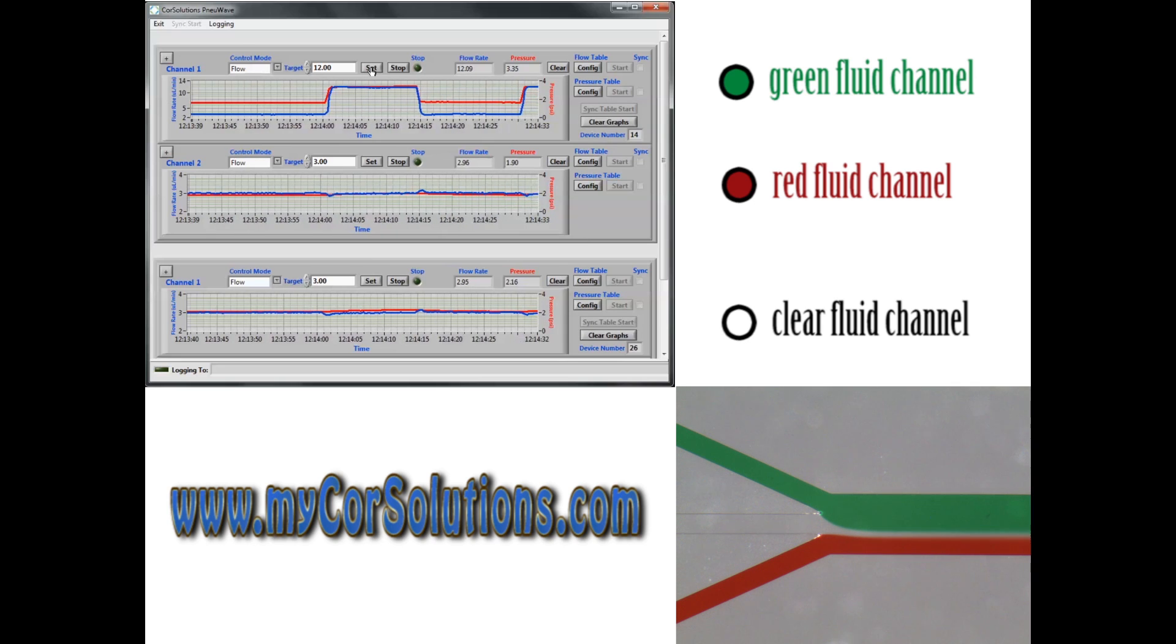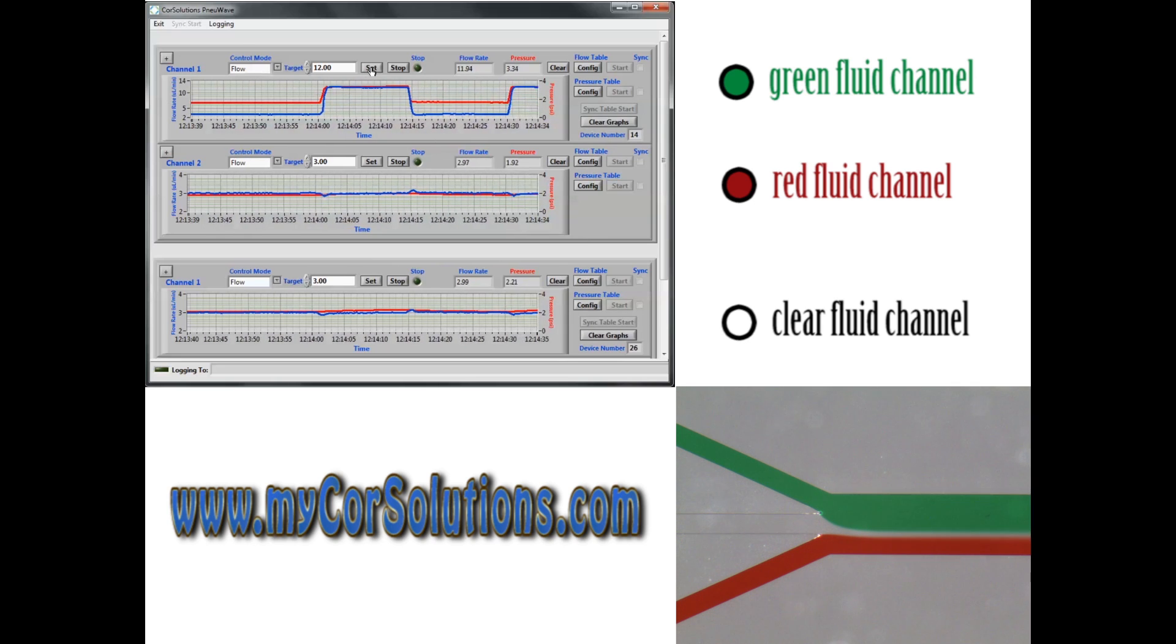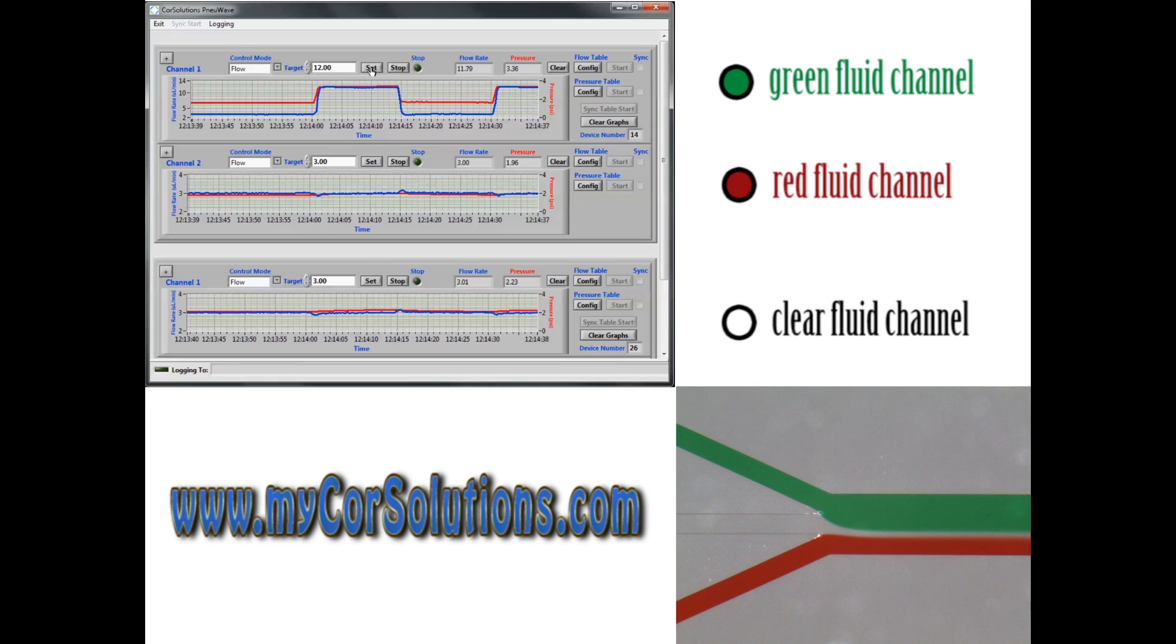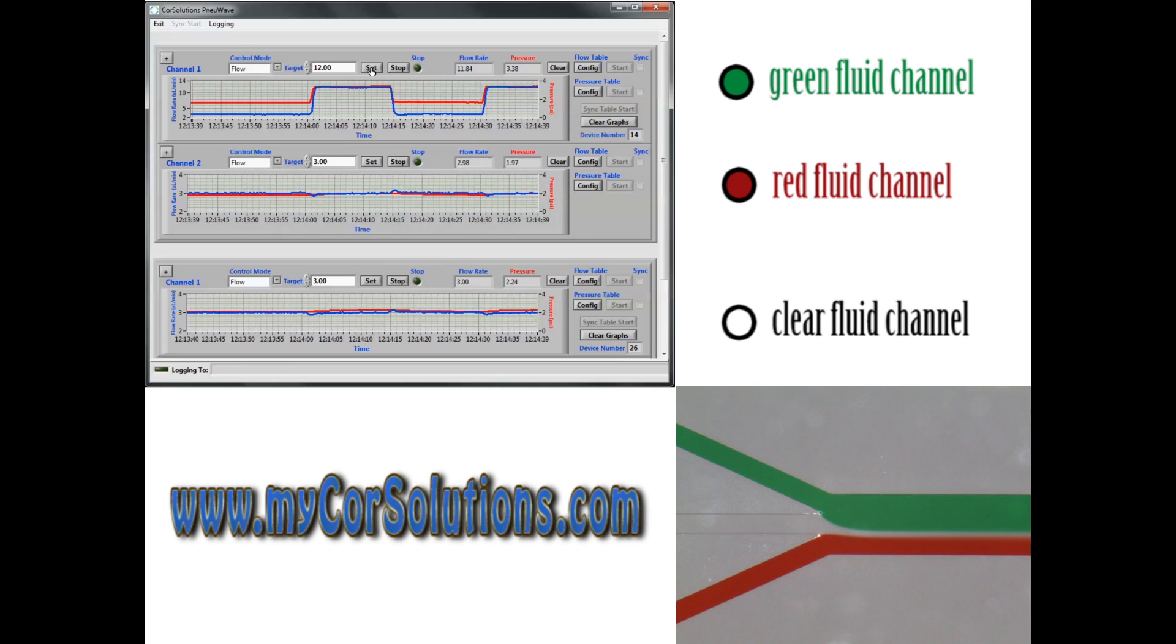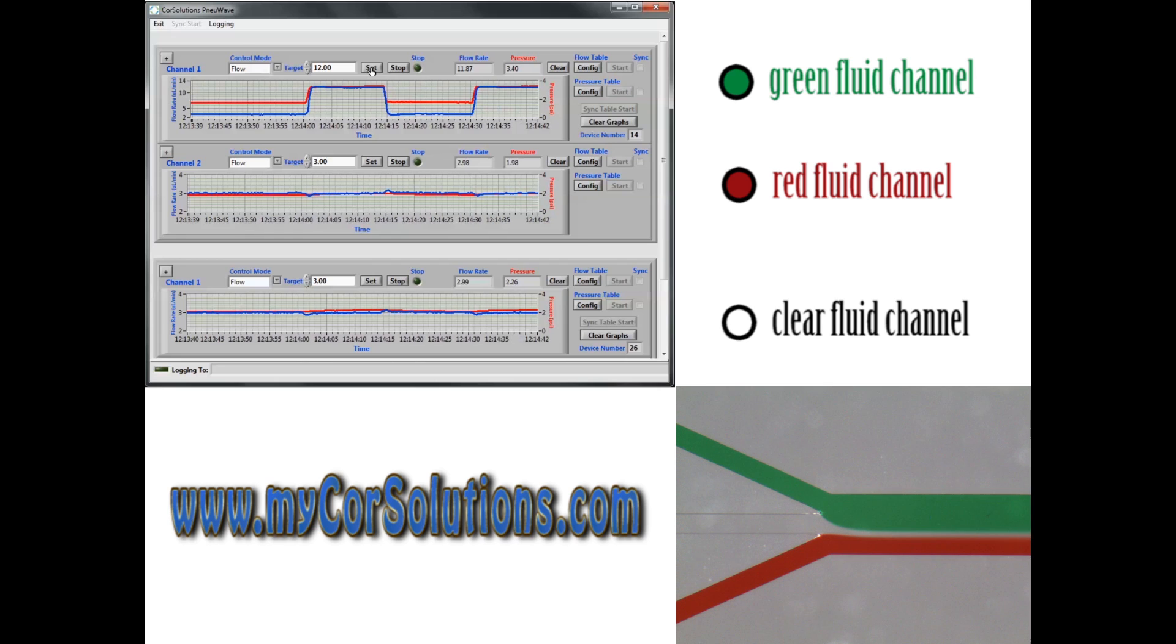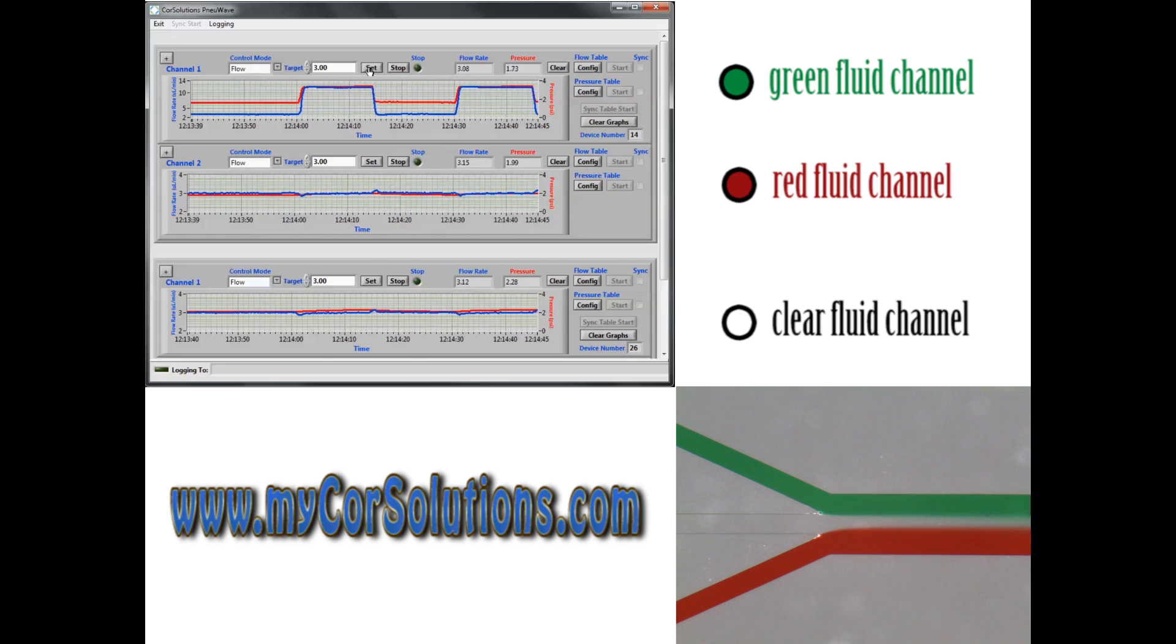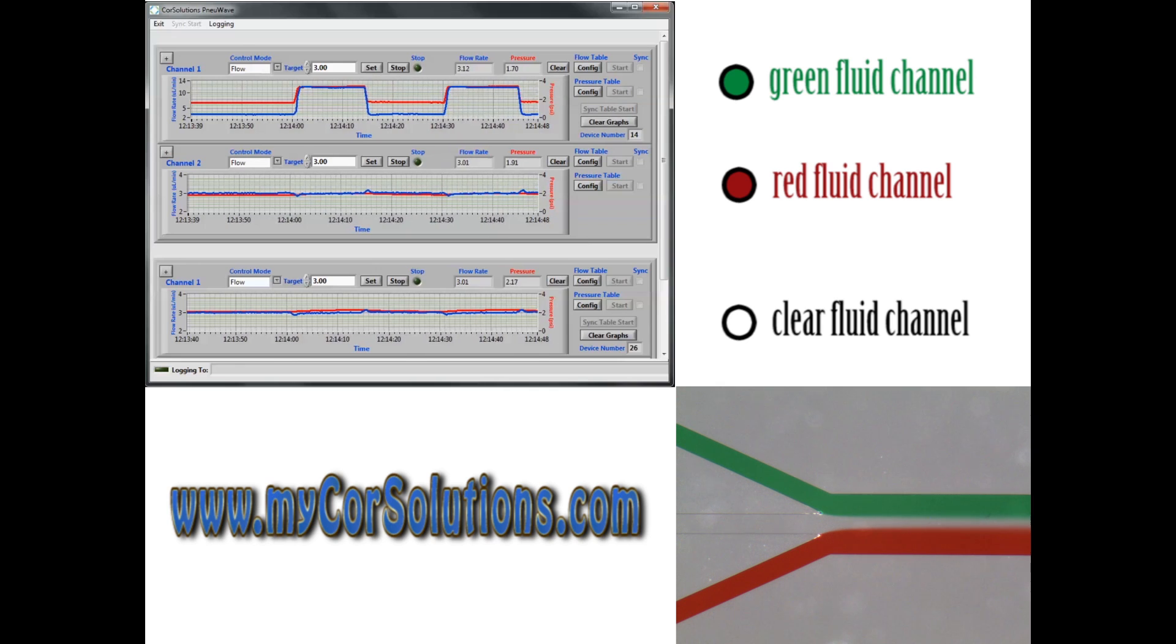Next, the green liquid channel is returned to 3 microliters per minute before repeating the experiment. You can see that the flow rates for the clear and red channels, shown in the blue lines of the bottom two plots, are not affected by the drastic flow rate changes in the green channel.